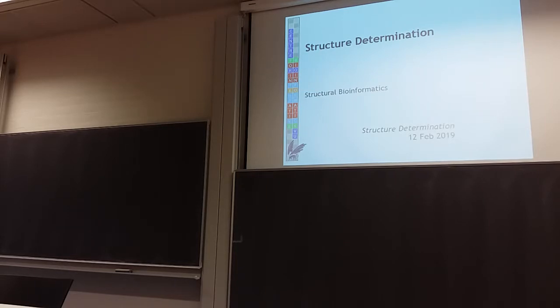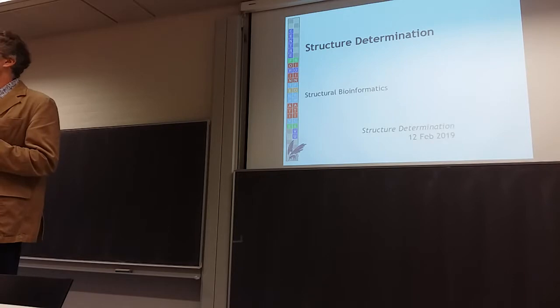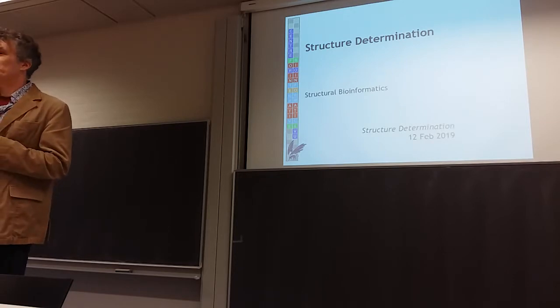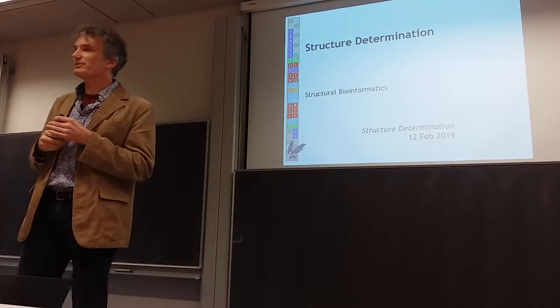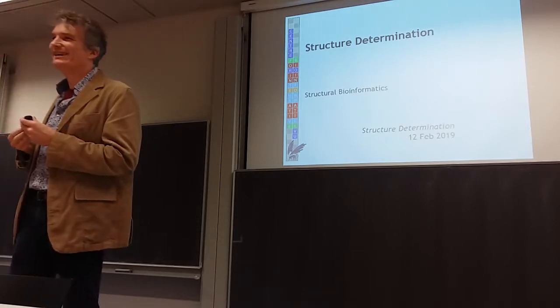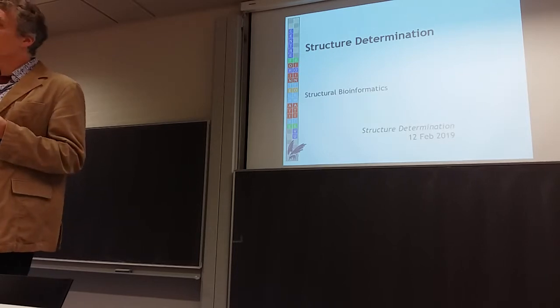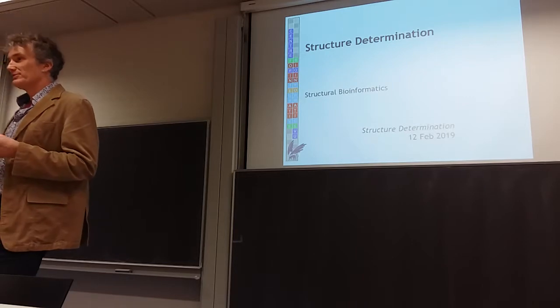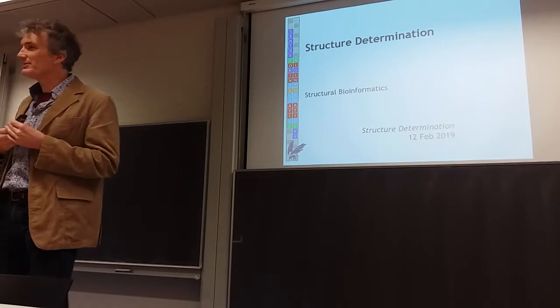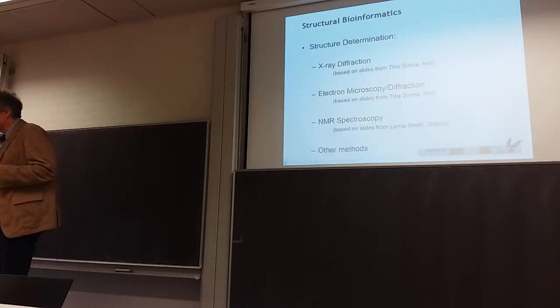So, what do you already know about protein structure determination, experimental methods? Crystallography. Right. Oh, you've been reading the chapter. NMR. Yeah. EM. Small angle scattering, you mean? Okay. Right. So that's sort of the summary of today's lecture, right?